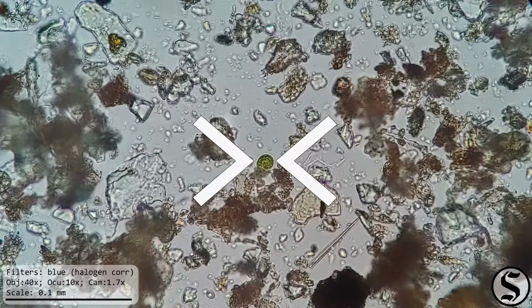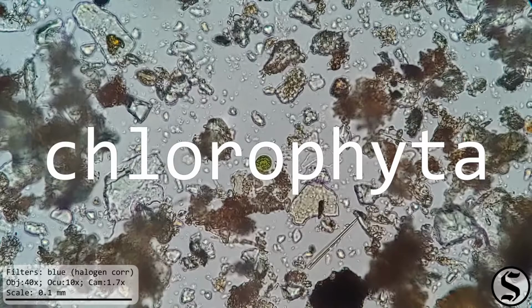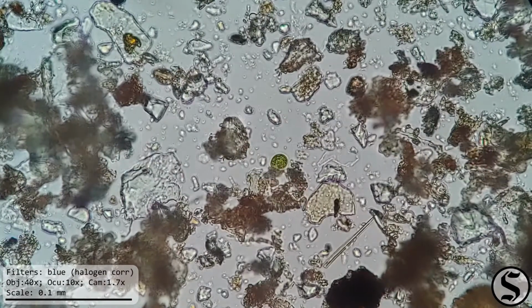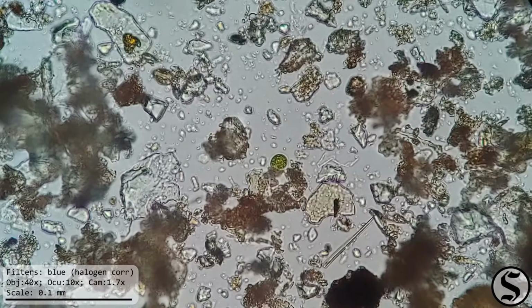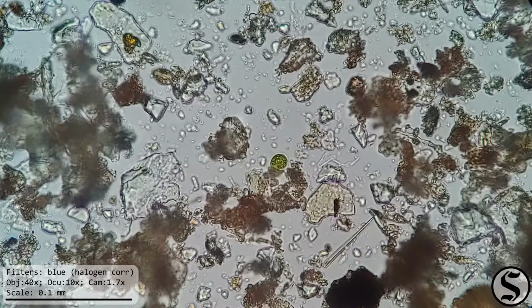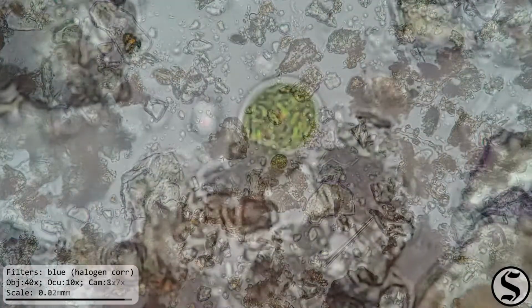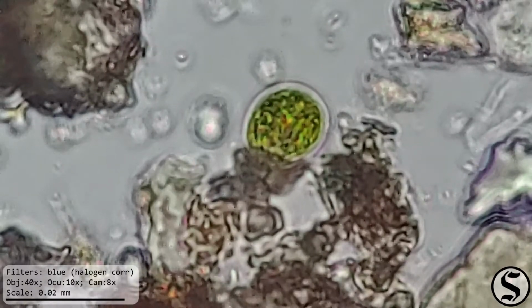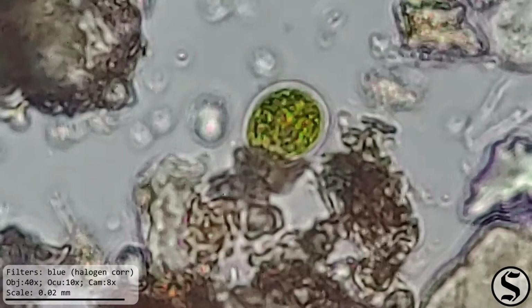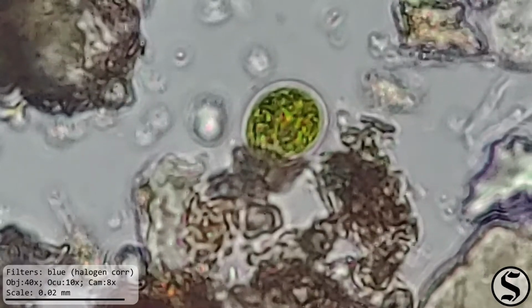Some form of green algae, probably chlorophyta. That's Greek chloros for green and phyton for plant. Well, even if we don't know what something is, that doesn't stop us from observing it, taking note, and maybe somebody watching might know what it is.